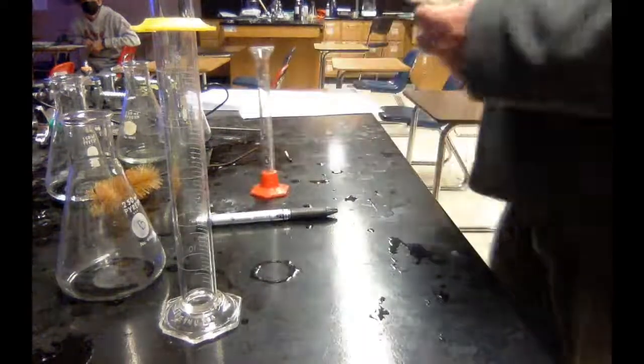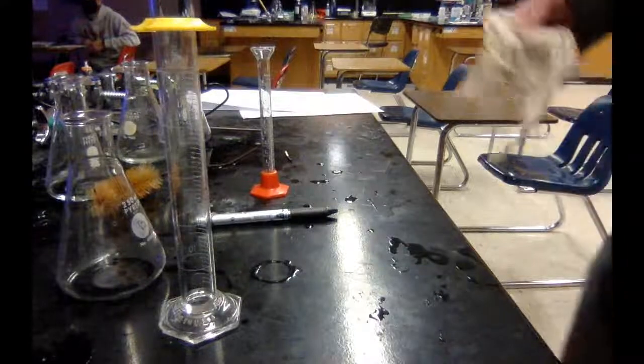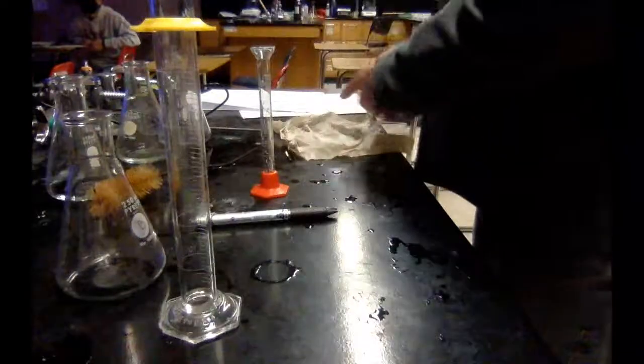Why do you think it says 100 milliliters? Because of more space. Yeah. But you should not fill it all the way up to 100, right? It should only be up to 50 still. Why do we even go to 50 if we only need 40? So the air. Yeah, right.